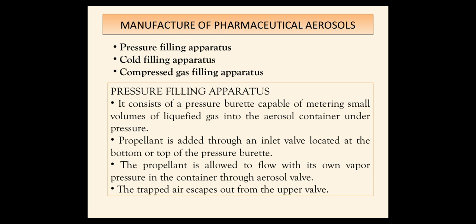Hello students. In this part of aerosol, I'm going to cover the manufacturing and accuracy test. Manufacturing of pharmaceutical aerosol includes main three parts, and this is the most important point of view. It includes pressure filling apparatus, cold filling apparatus, and compressed gas filling apparatus.